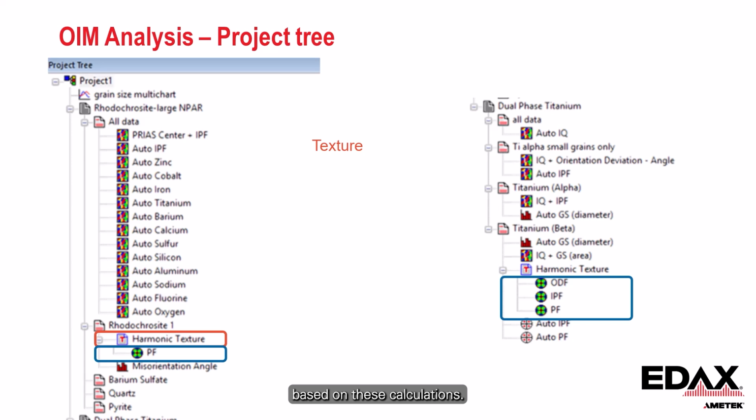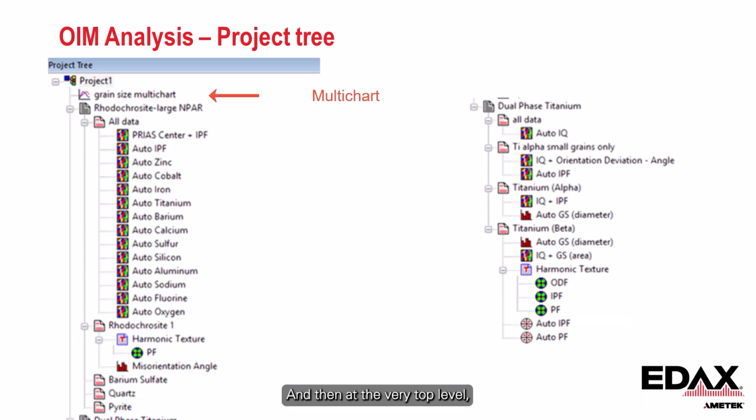these calculations. And then at the very top level, we have a function here called multi-chart. This is when we want to plot data from multiple different data sets or different partitions. We access that through the multi-chart functionality.